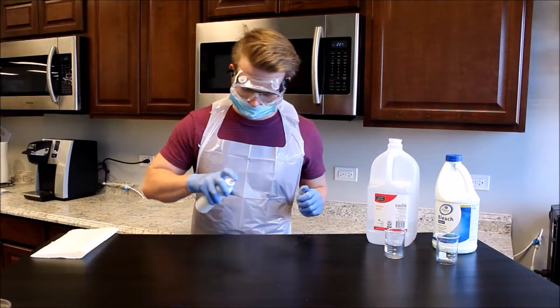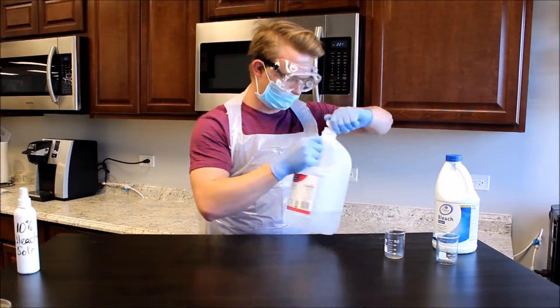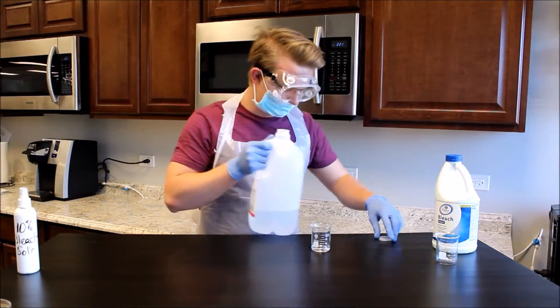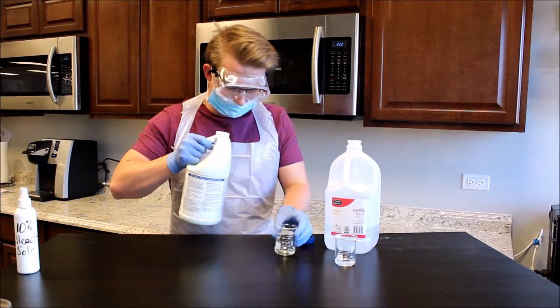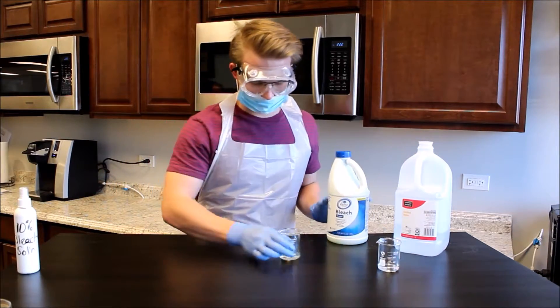Wipe down work surface with 10% bleach solution. Pour 20 milliliters distilled water into a 100 milliliter glass beaker. Pour 20 milliliters of bleach into the 100 milliliter glass beaker.